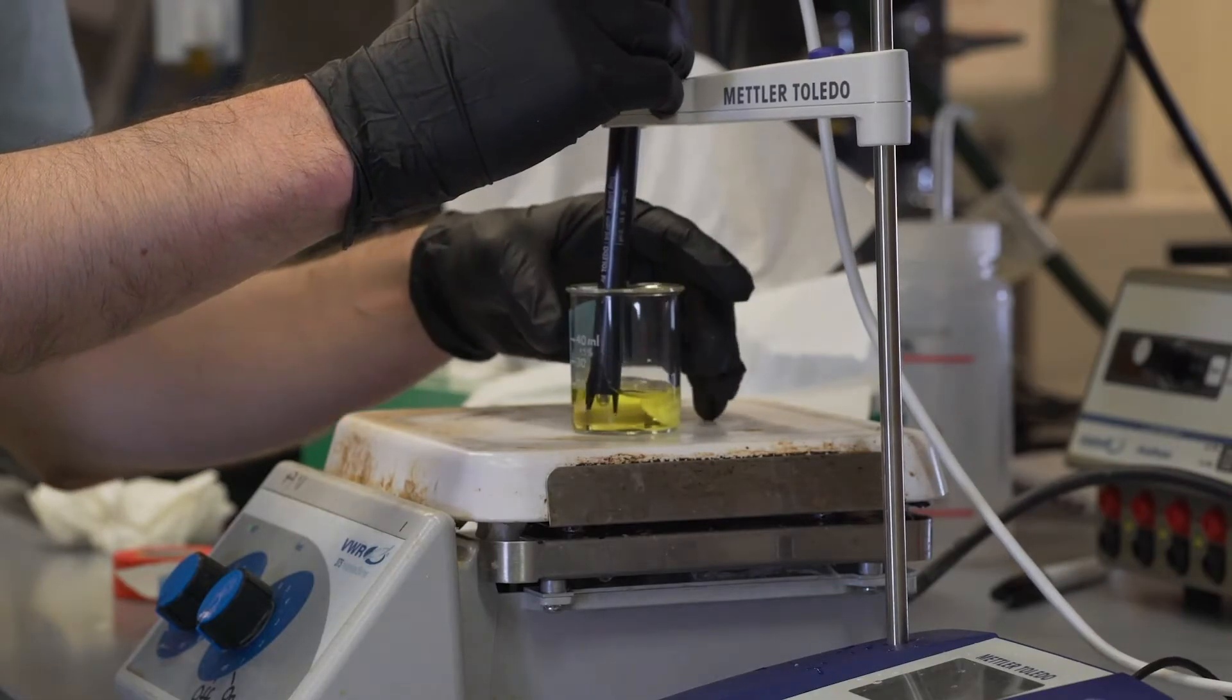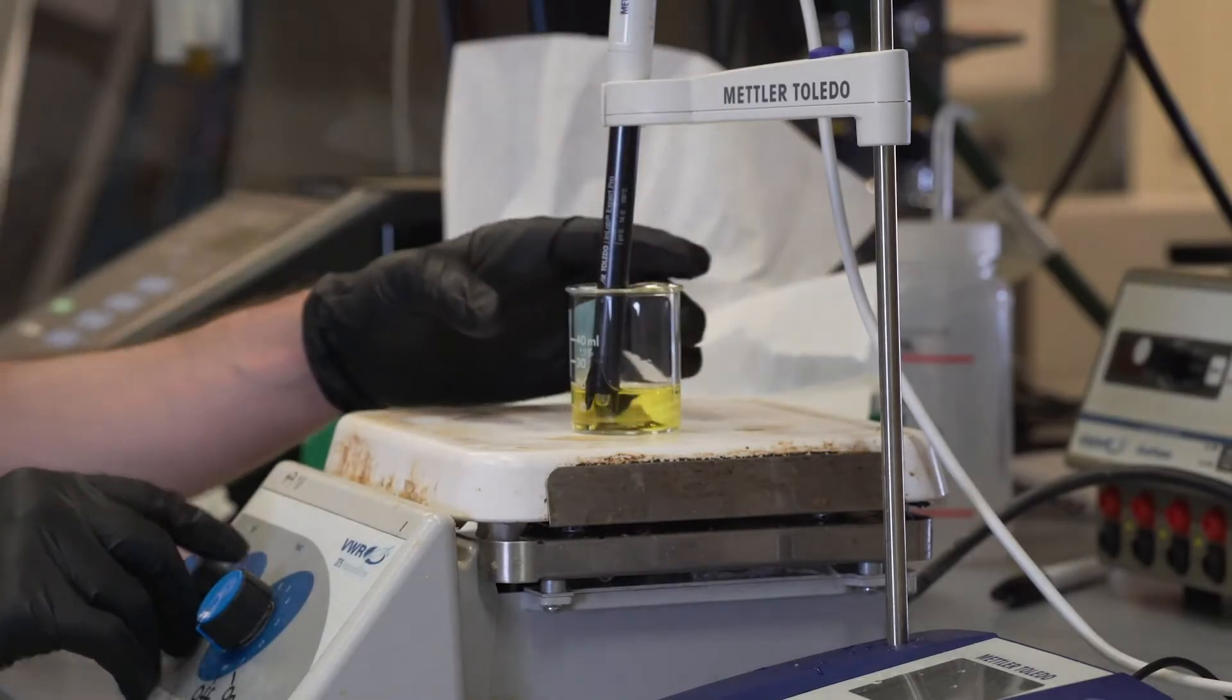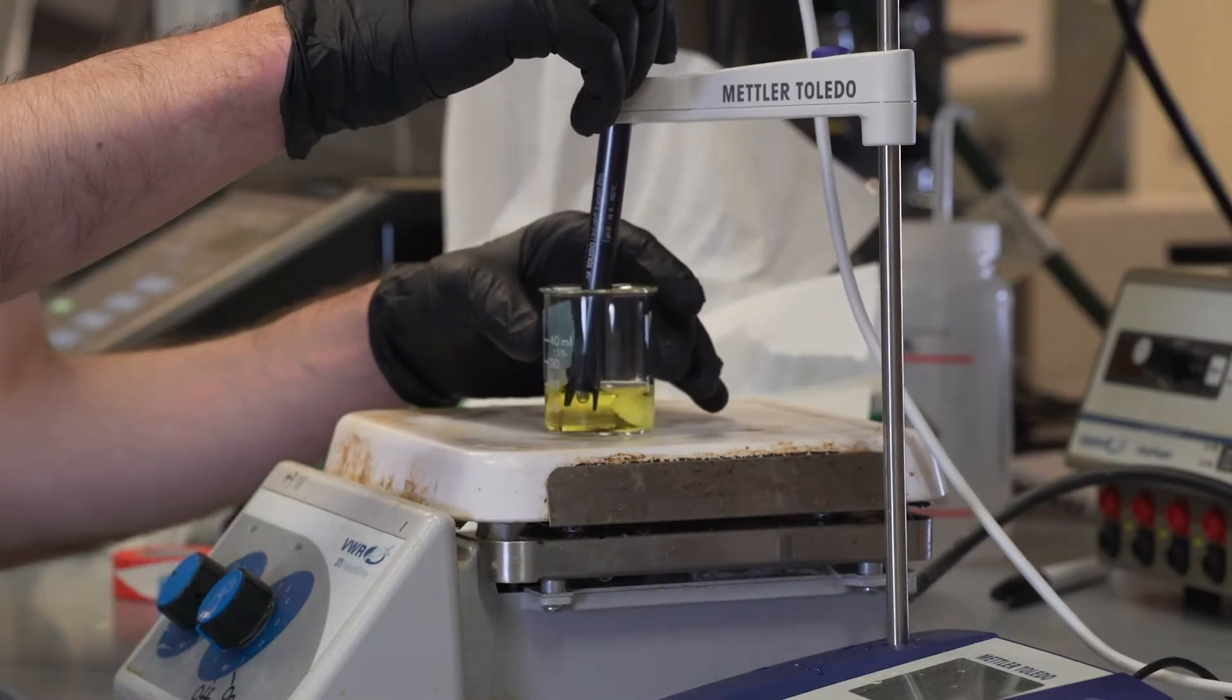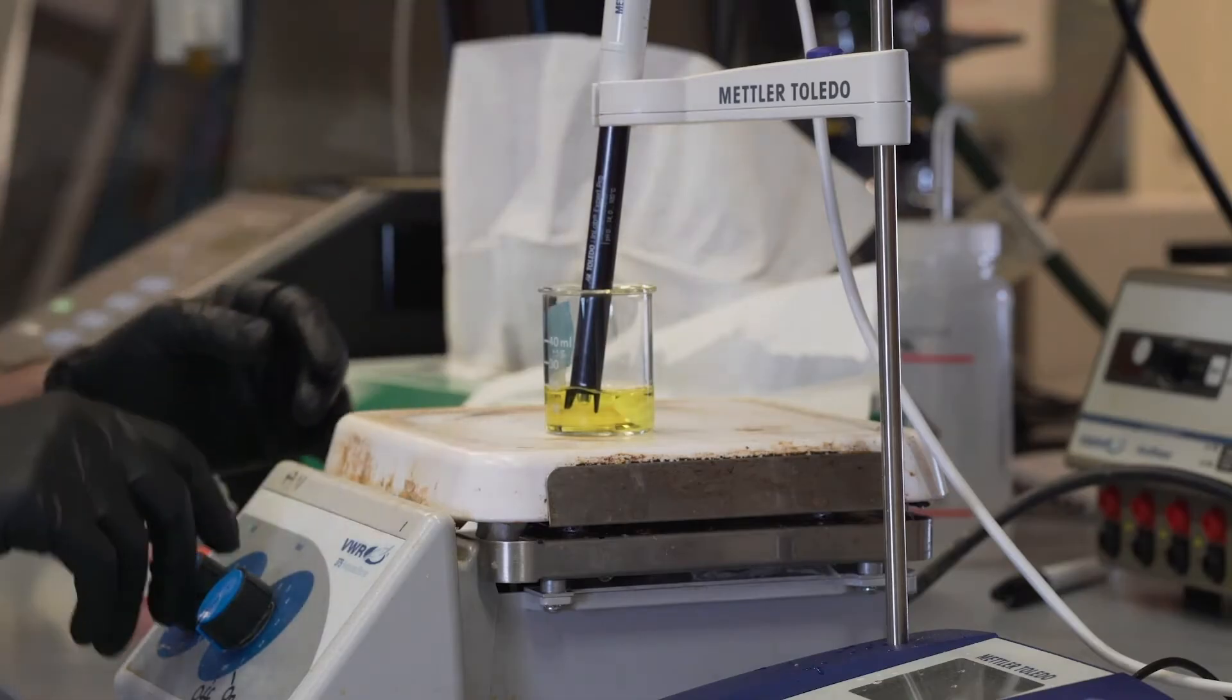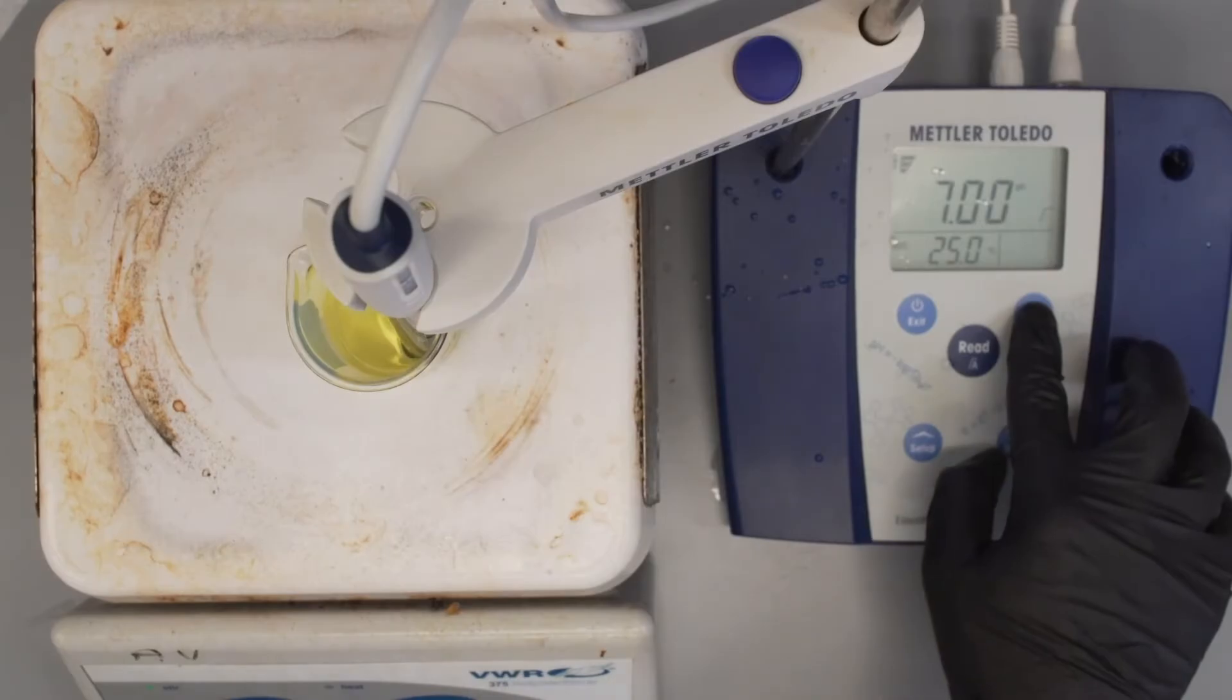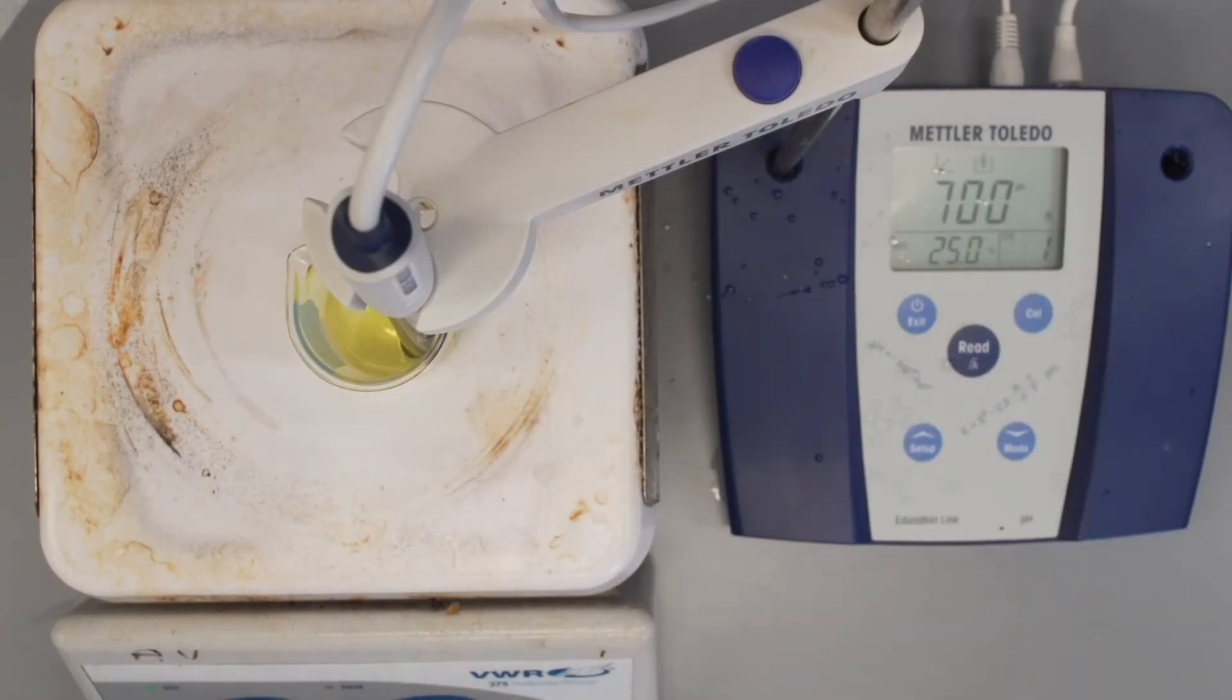The calibration should begin with the pH 7 buffer. Submerge the electrode in the buffer, but make sure it's not touching the bottom of the beaker or a stir bar if you're using one. Press the calibrate button on the pH meter panel and wait for the readout to stabilize.